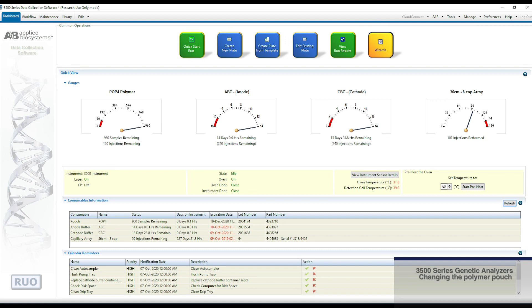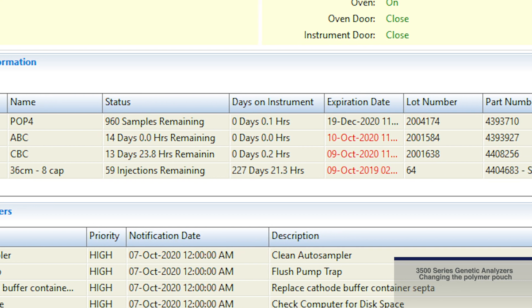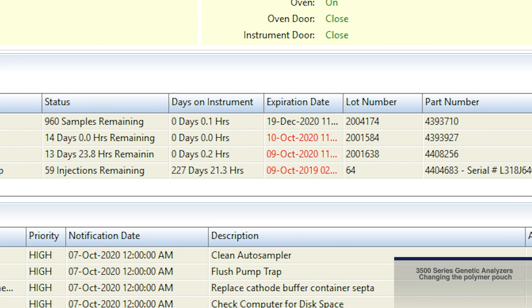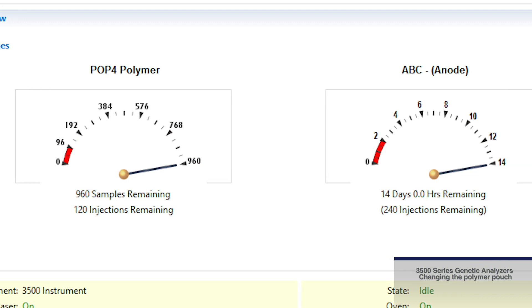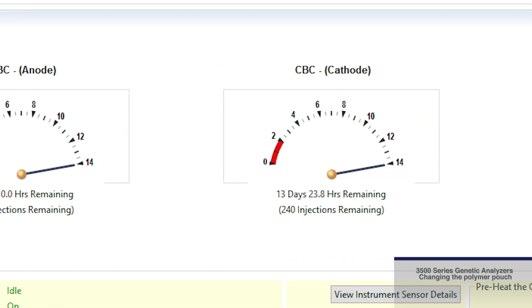Once a consumable has been changed on the Applied Biosystems 3500 genetic analyzer, a quick check of the dashboard should show the new lot information for that consumable. Information on consumables can be seen in the gauge section on the consumables information section.